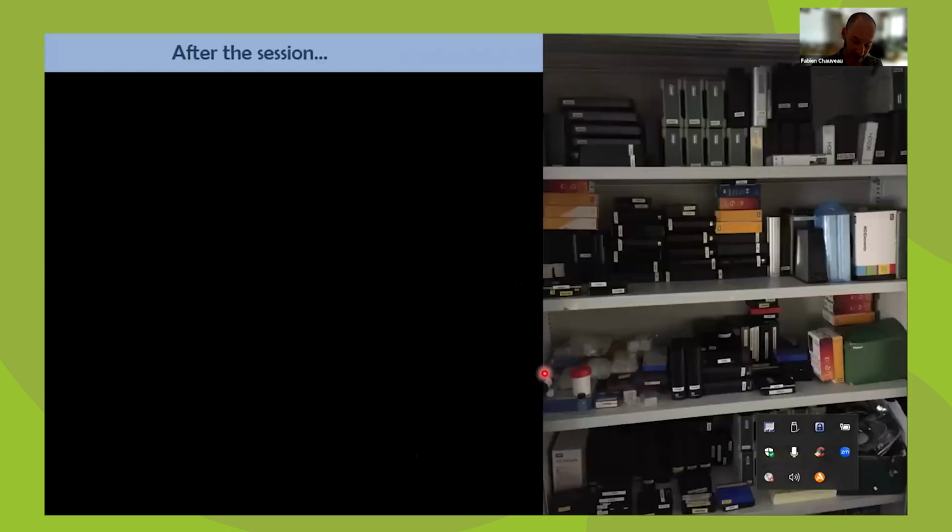Then one challenge is that you end up with really big data. So raw reconstructions will typically be 100 of gigabytes. And when you optimize your field of view or crop your image or compress it a bit, I'm talking of a mouse brain, you usually end up with an image that is from 10 to 20 gigabytes. So it's quite big.